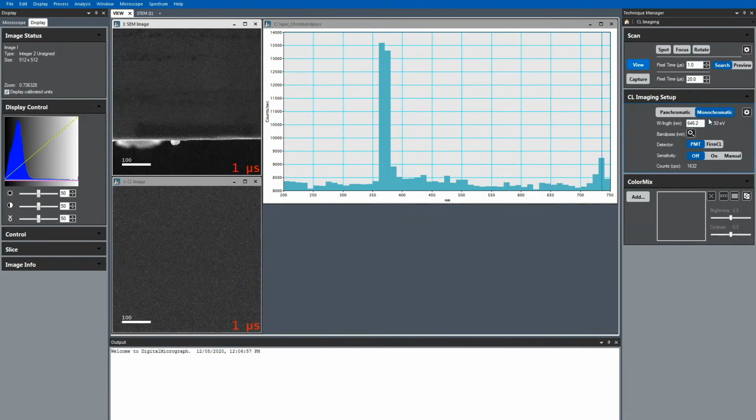That's interesting. Okay. Looks like I may have to wait for this. Oh no, now it's going back. It was going the wrong way.